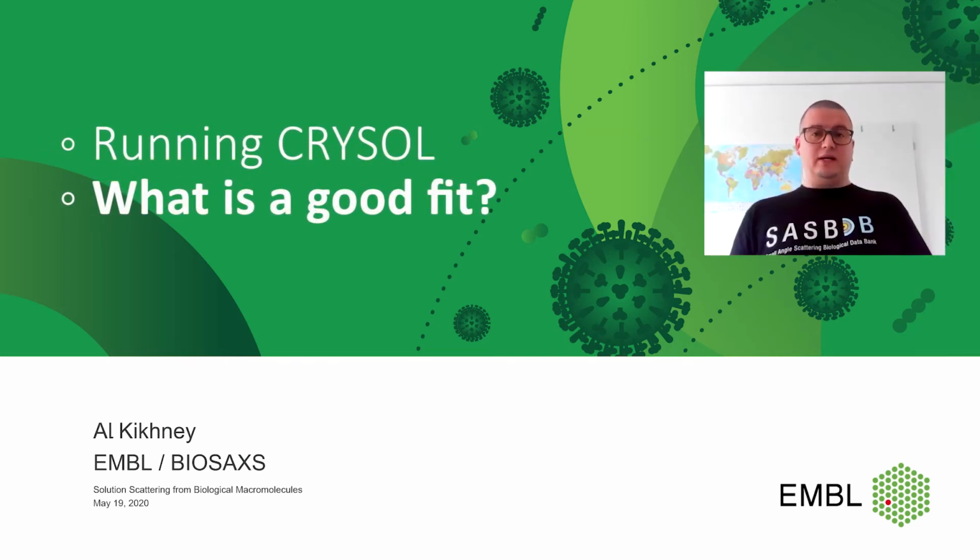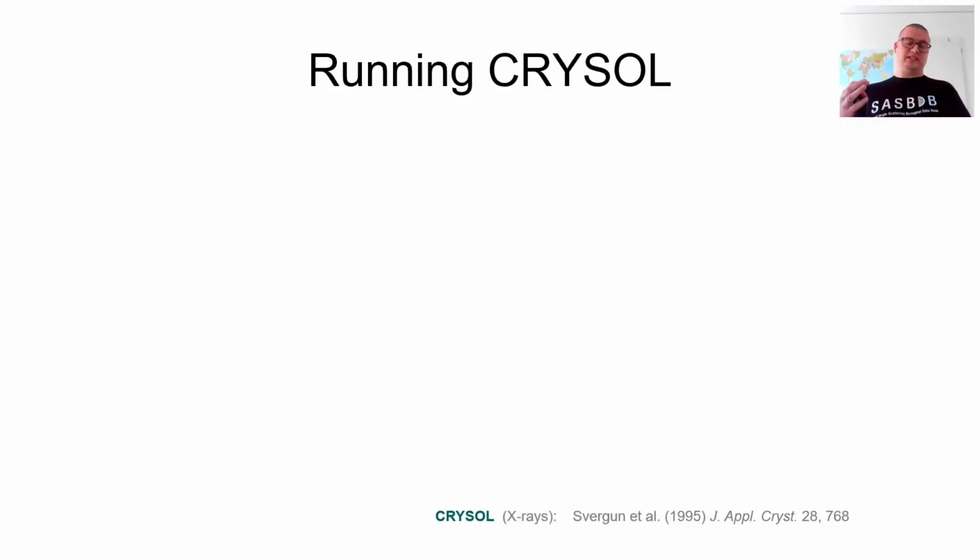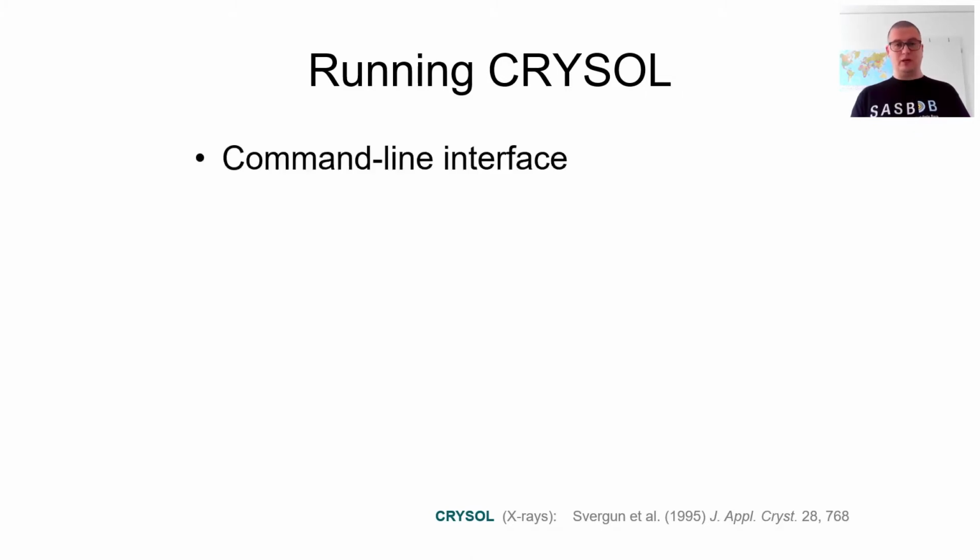First of all, I would like to tell you about a program called CRYSOL. CRYSOL computes the scattering of a given model and fits it to the experimental data. There are several ways how you can run CRYSOL. I prefer using the command line interface. This allows easily for scripting, etc.